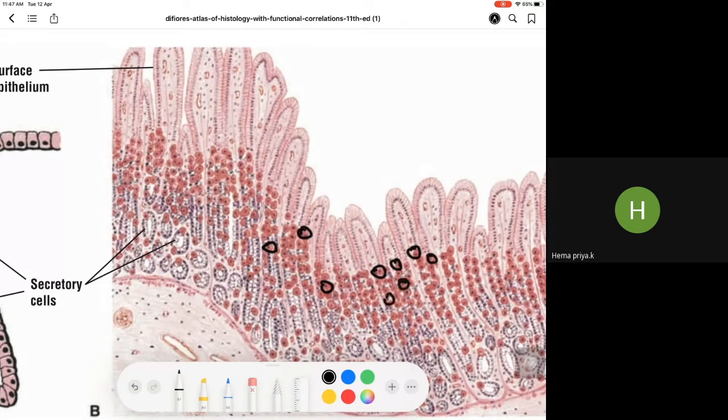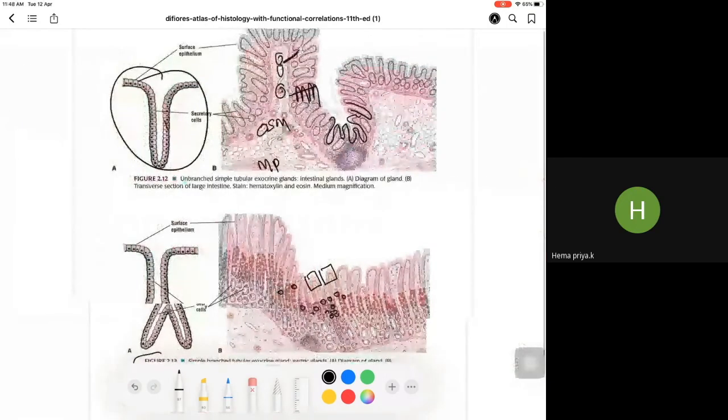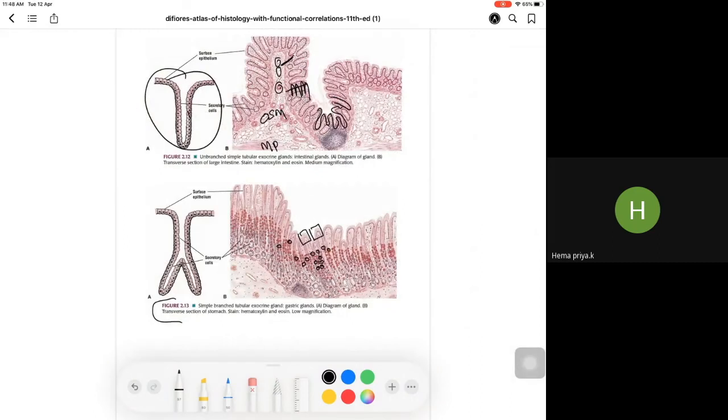What can be these cells with abundant pink eosinophilic cytoplasm? These are the parietal cells, surface secretory epithelial cells. So the neck and the body has the parietal cells, and these parietal cells are situated only in the gastric fundus and body. They are not present in the cardia and antrum.